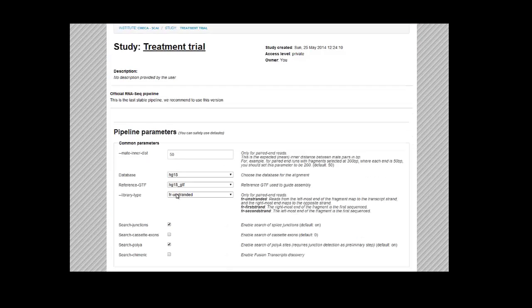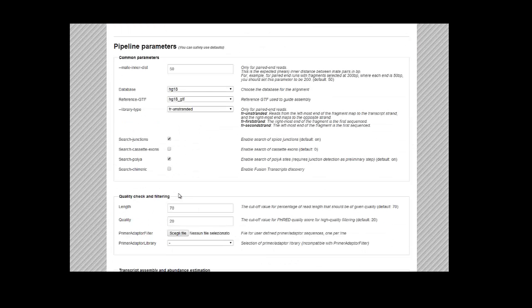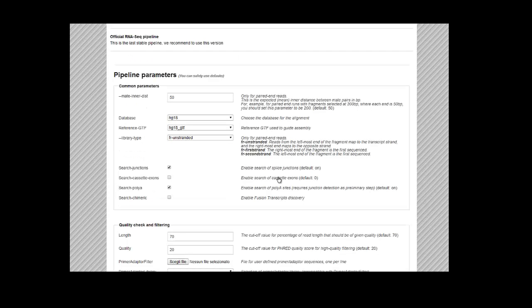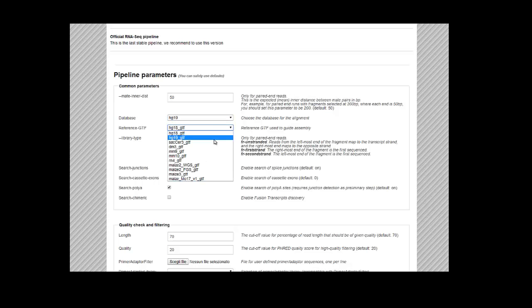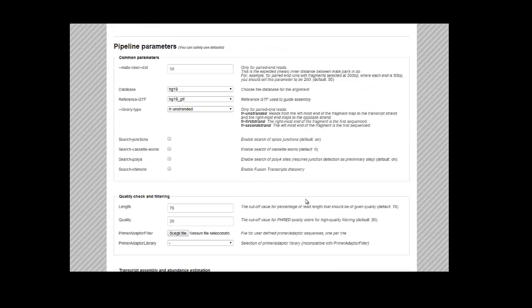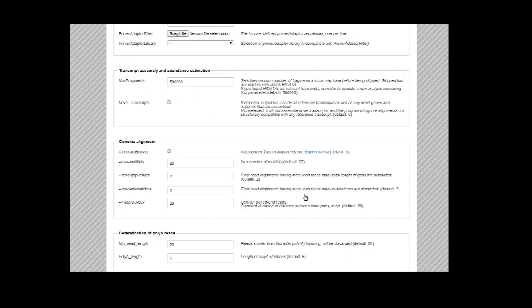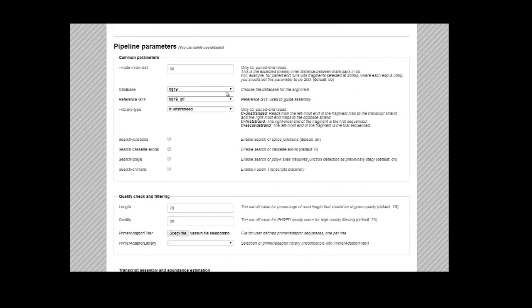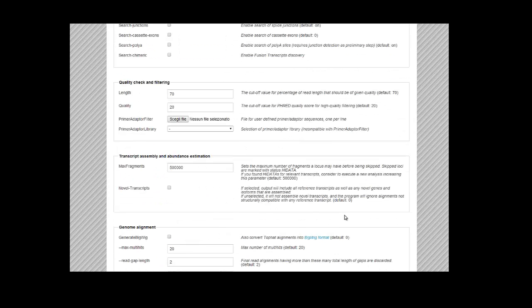Here we are. This is the pipeline parameters section. So here we can select the parameters for our analysis. We can select HG19 for our databases, and we can skip the optional steps of the pipeline. For the rest, I'm going to safely leave the default parameters.